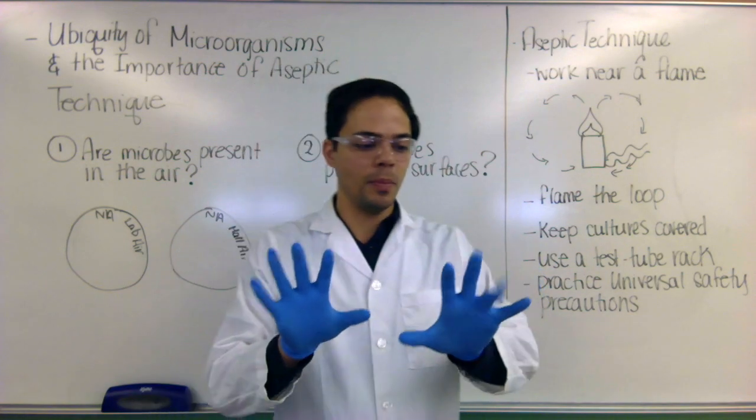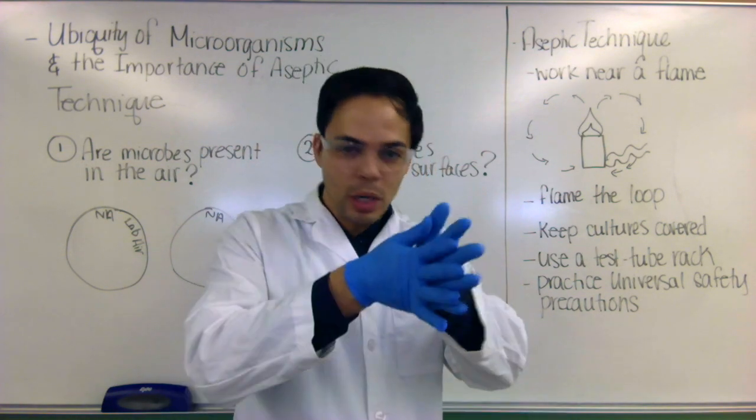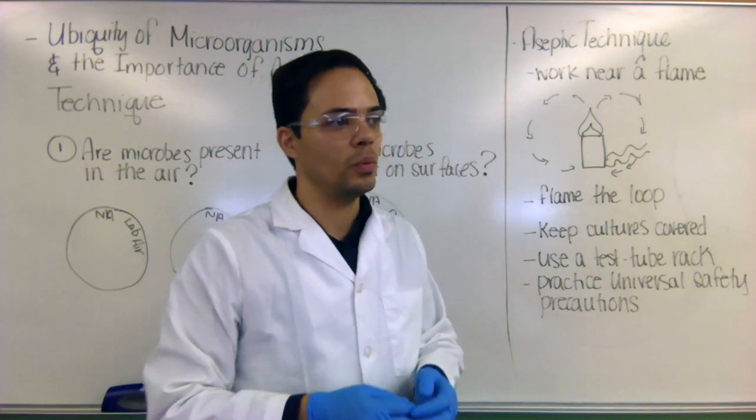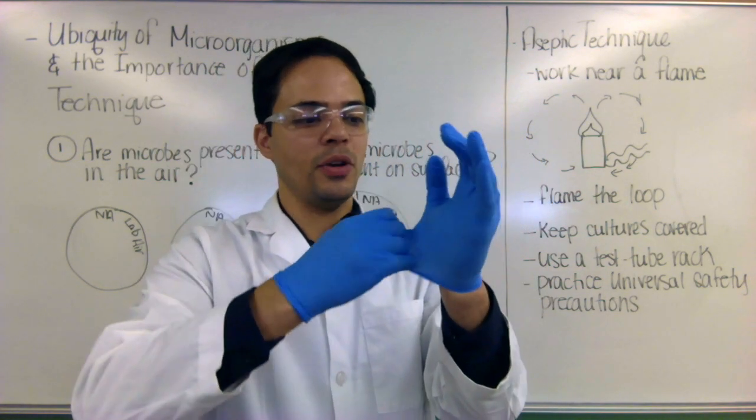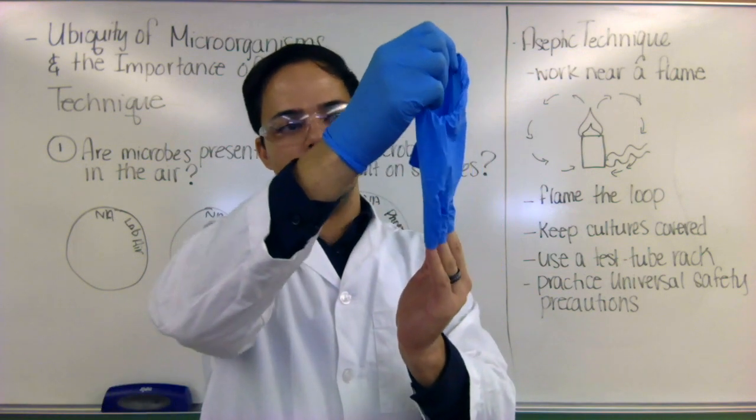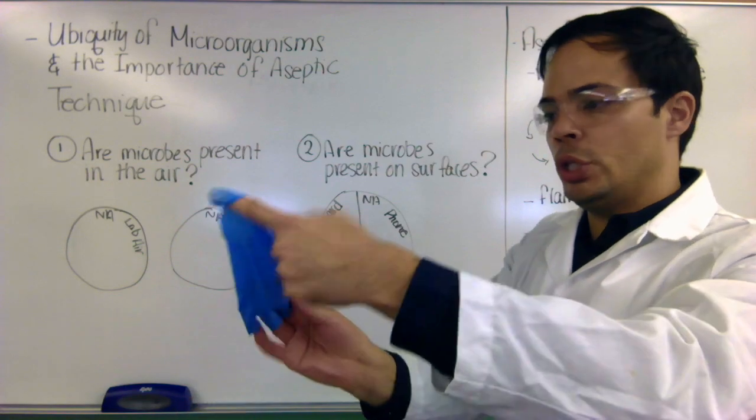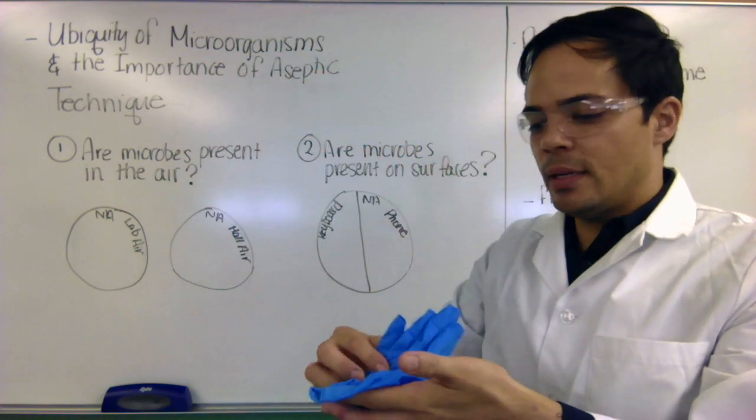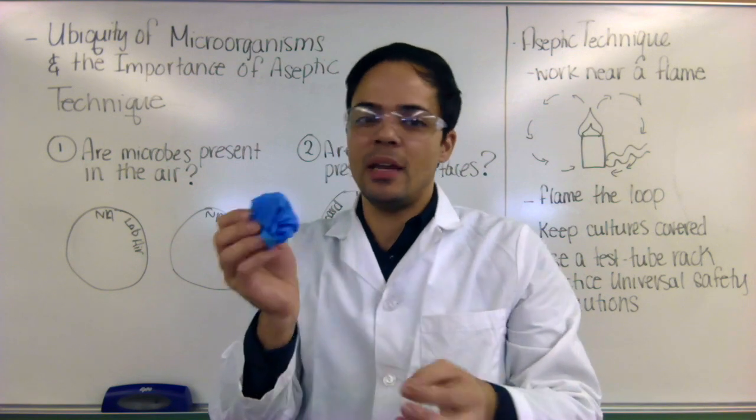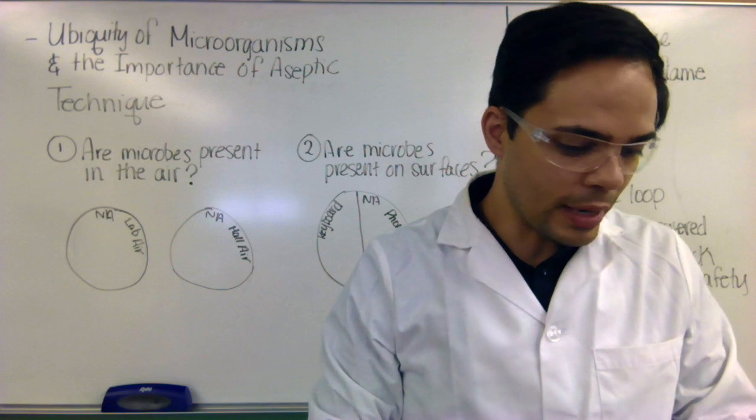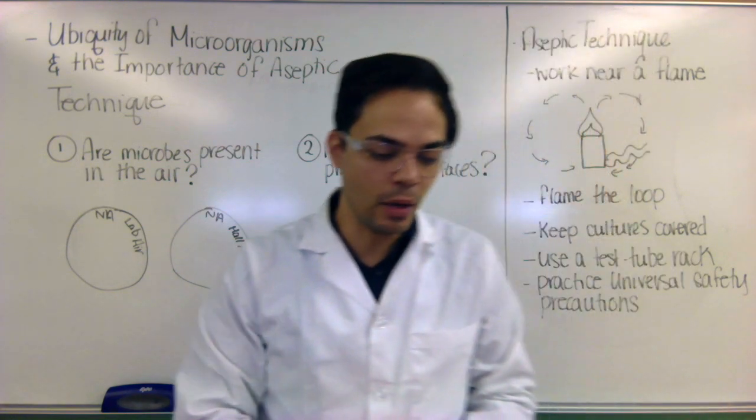Remember that your gloves have a lifespan. So eventually, liquids do move through this barrier. And so you want to change your gloves out when you're done. Don't wash your hands and then save your gloves. You can't do that. That will not clean the gloves. And the way you want to take off your gloves is to take your hands, pinch it here. And you're going to fold it so that the gloves fold outward like that. Then you want to bunch that up into your other hand and then take your finger, go inside and form a little pouch. And now all of the contamination is on the inside and not the outside. And then that you can put in the biohazardous waste container if it's really contaminated with microbes. And if it's not, if you think it's pretty fine, you can just throw it in the regular trash. If you were working in a clinic, this would need to go into some sort of biohazardous waste, especially if there's blood, tissue or urine or something like that on it.